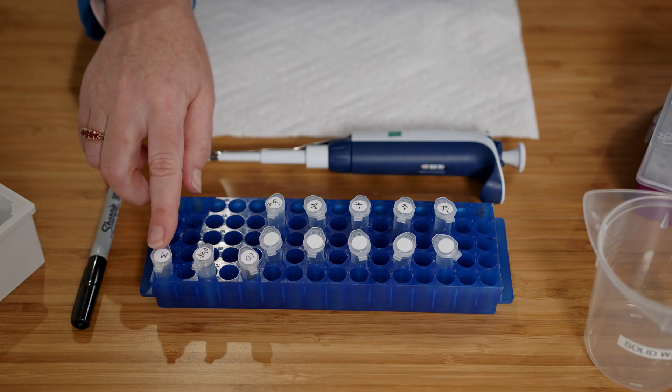I'll also be using a marker or DNA ladder. This has known size fragments in it so that we can tell on our gel what size the fragments in our samples are.